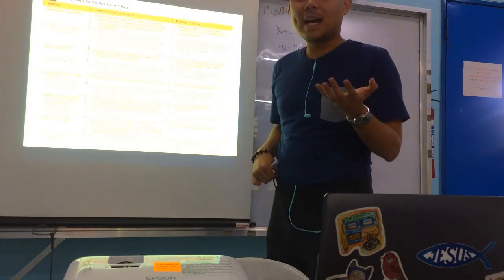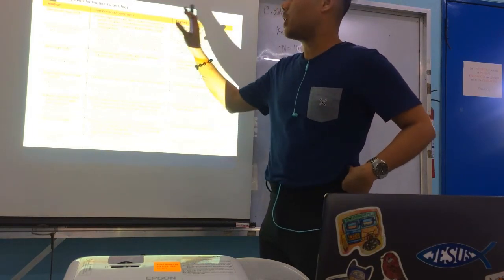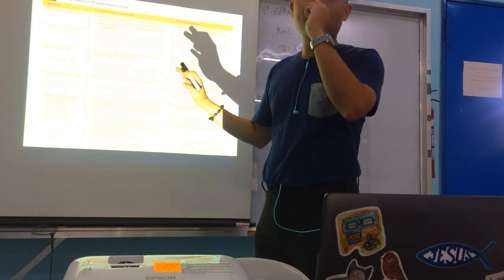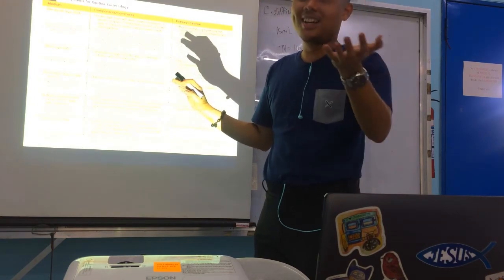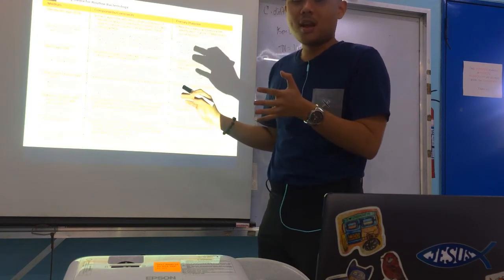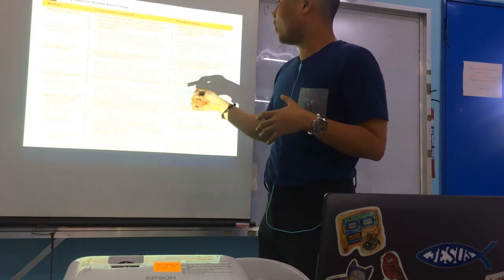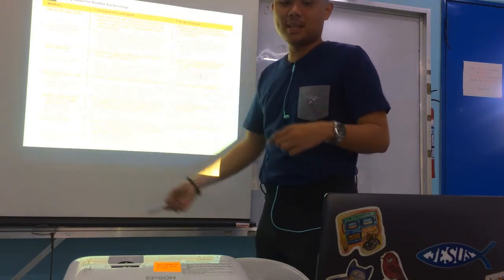In the intro to microbiology lecture, I already told you that it's good to become familiar with these names, because when we go to bacteriology, which is now, usually when we talk about culture media we use only the acronyms. We don't usually spell them out. So it's good that you are familiarized now with these acronyms.